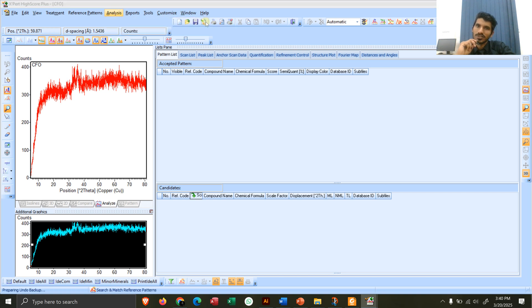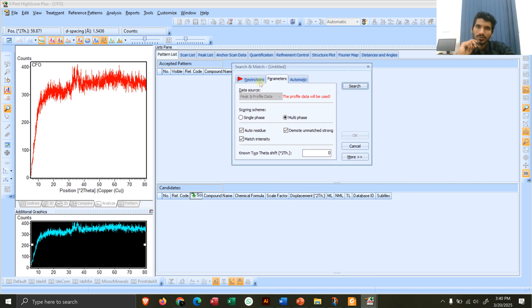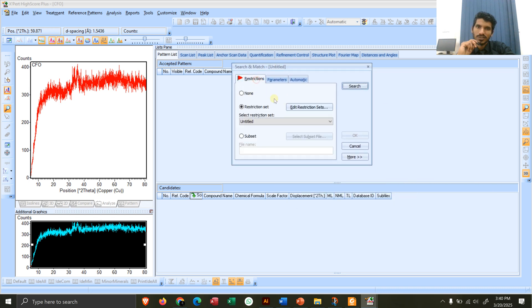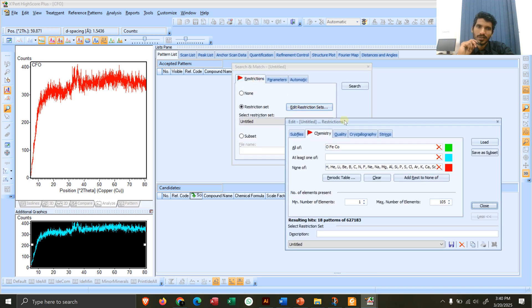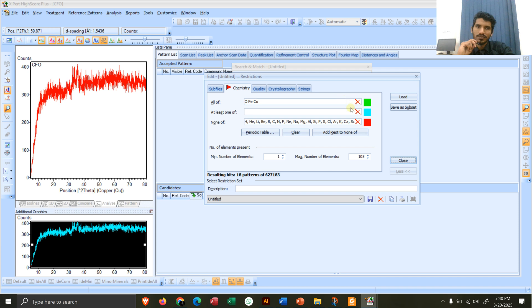Next, go to Analysis, then Search and Match, then Execute Search and Match. After that, go to Restrictions → Edit Restriction Sets. First, make sure that both columns are empty — perform the clear (cross) so all entries are removed.